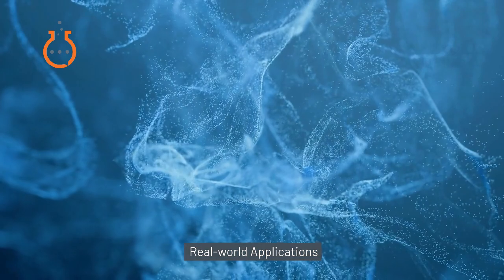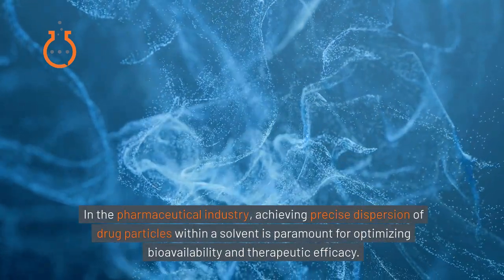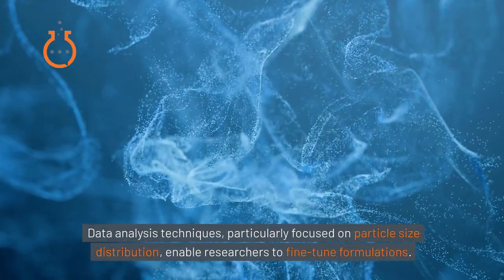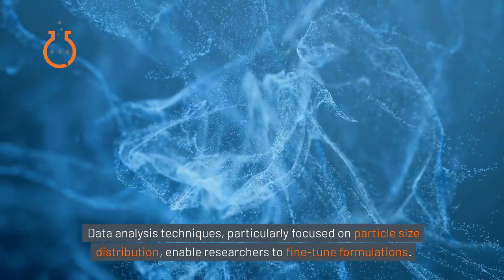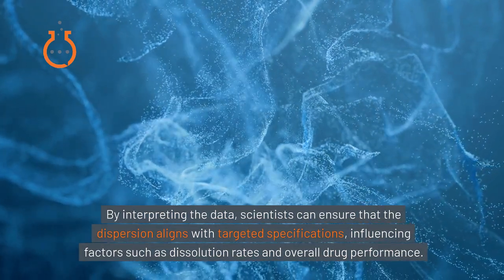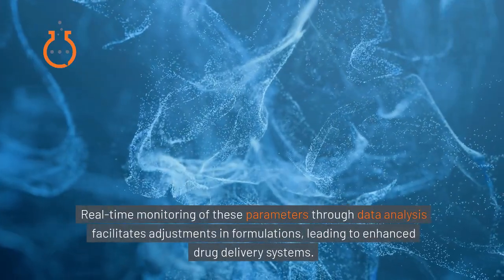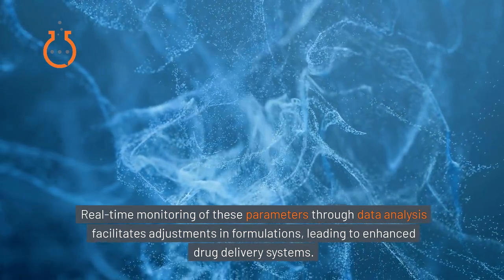Real-world applications. In the pharmaceutical industry, achieving precise dispersion of drug particles within a solvent is paramount for optimizing bioavailability and therapeutic efficacy. Data analysis techniques, particularly focused on particle size distribution, enable researchers to fine-tune formulations. By interpreting the data, scientists can ensure that the dispersion aligns with targeted specifications, influencing factors such as dissolution rates and overall drug performance. Real-time monitoring of these parameters through data analysis facilitates adjustments in formulations, leading to enhanced drug delivery systems.